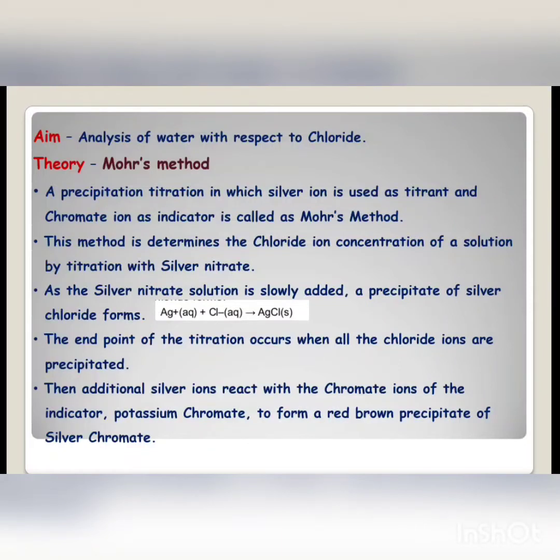Hello everyone. Today we are going to see the analysis of wastewater sample with respect to chloride. It is how to determine chloride from the wastewater sample that we are going to see today. This method uses Mohr's method, and we are going to follow the procedure according to Mohr's method.